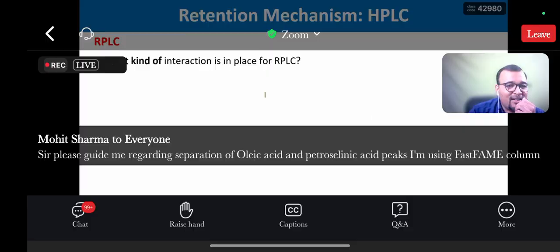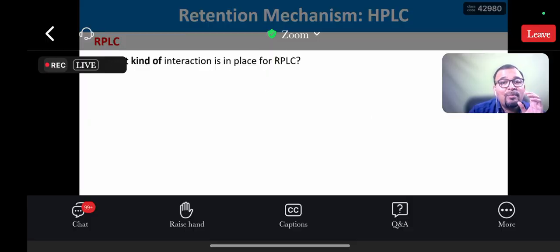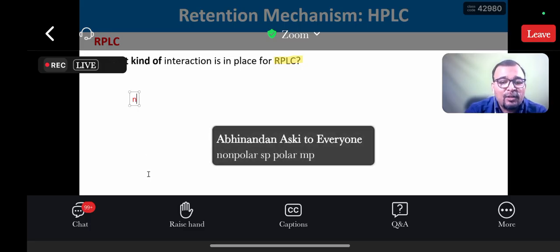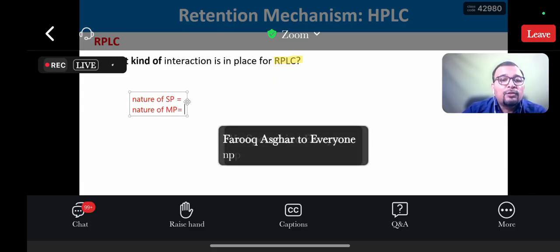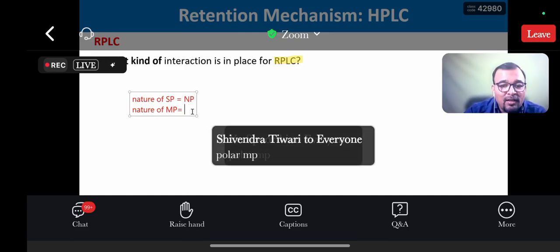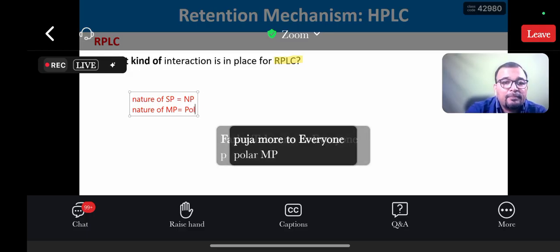What kind of interaction takes place in case of RPLC? What is the nature of the stationary phase, and what is the nature of the mobile phase? The stationary phase is non-polar, isn't it? And the mobile phase is polar. Fantastic. Thank you so much.